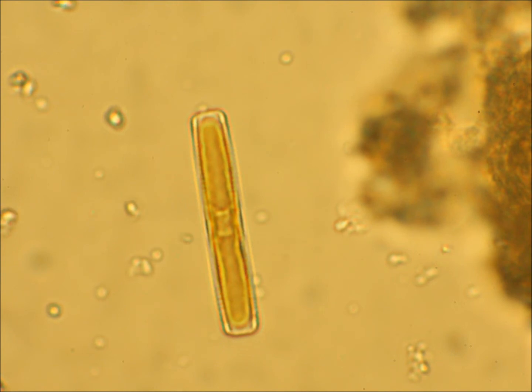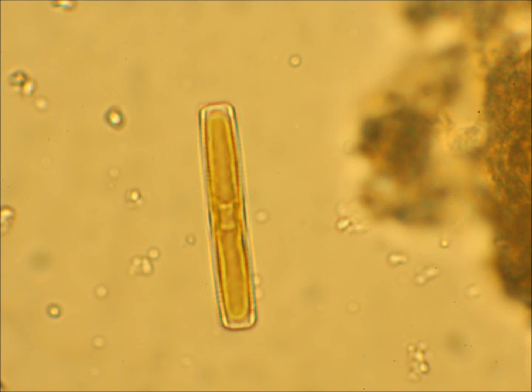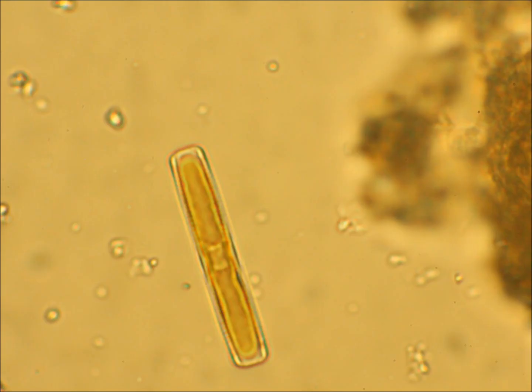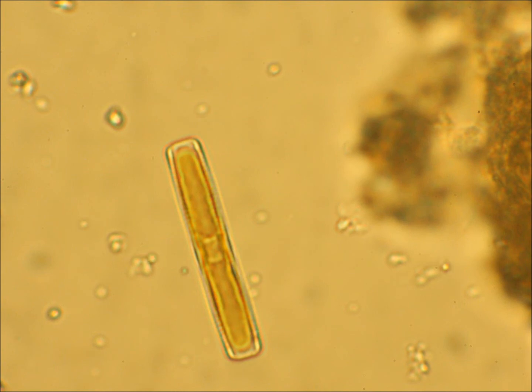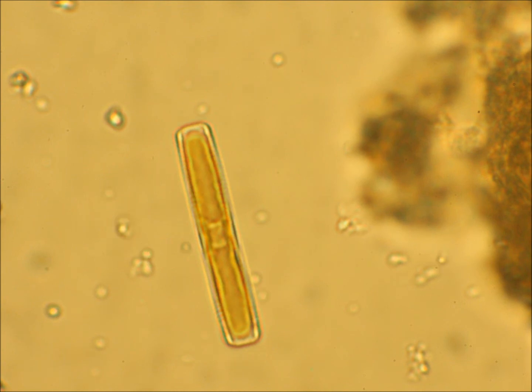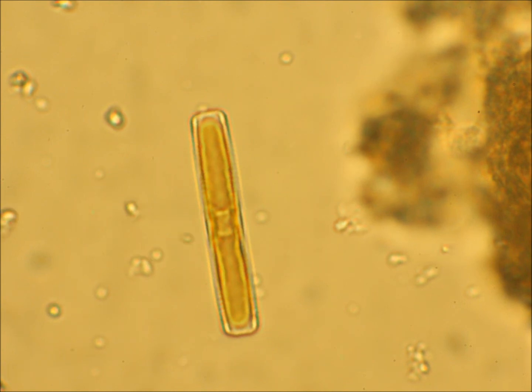Under phase contrast microscopy, you can see how they are nearly symmetrical, and in the case of Dorothy, under fluorescence boasts 2 glowing red lines, indicating the presence of 2 rows of chloroplasts on either side of the plane of symmetry. Sophia has only 1 row right down the middle, but they function similarly, supporting oneself. Dorothy and Sophia are not flexible like Blanche, but are able to withstand harsher conditions thanks to their silica outer shell.